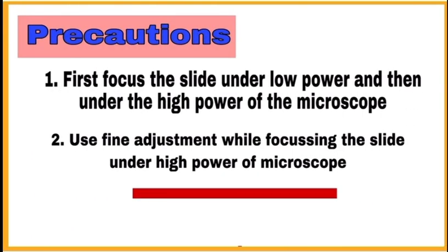Write precautions to be taken. First focus the slide under the low power and then under high power of the microscope. Second, use fine adjustment while focusing the slide under high power of microscope.